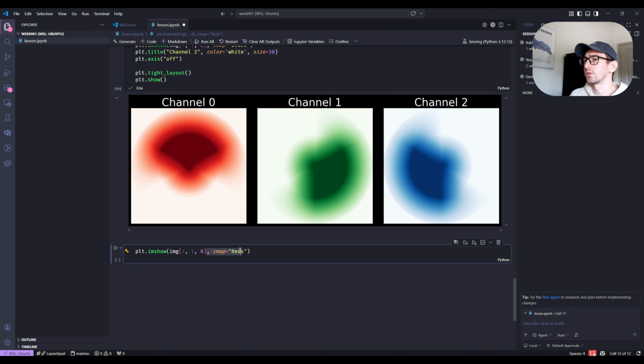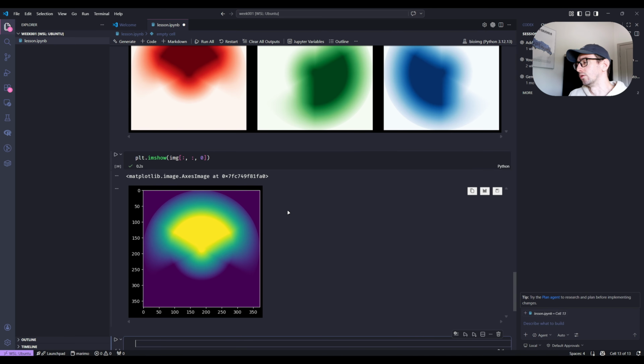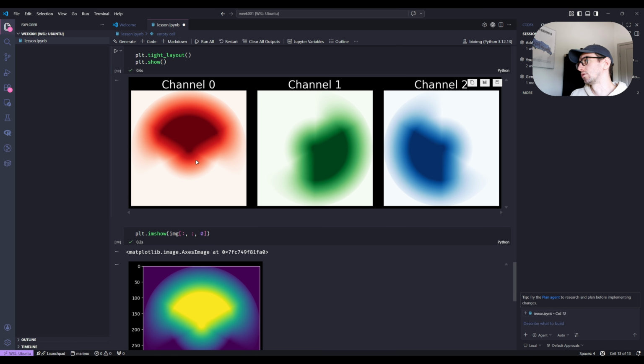But if I'm honest, for us it's generally not very important, because any image is just an array. And in case you use no CMap or the default CMap, it will look like that. So CMap is basically how you assign the color map to values that you have inside your array. In this case, we assign red to be 255 and 0 is white. Okay? Guys, is it clear about the order of the channels?